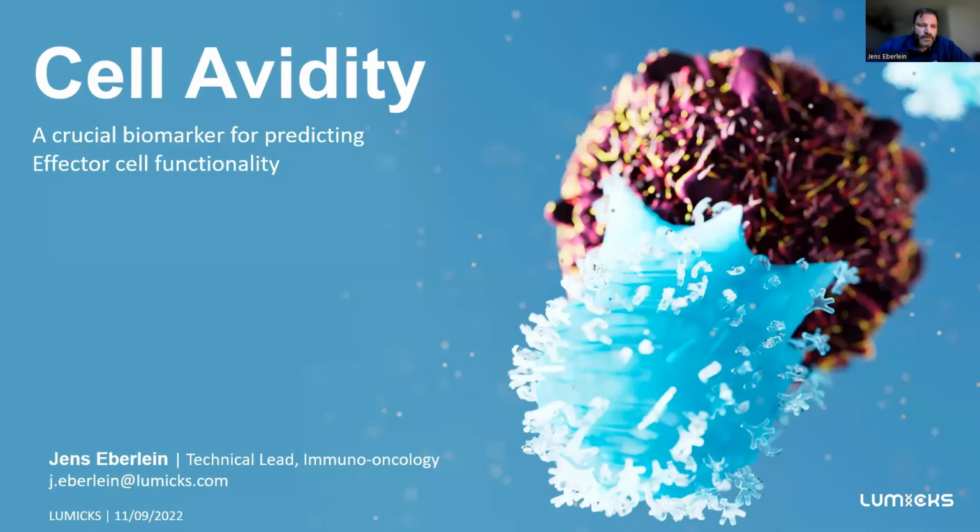By quantifying that engagement or strength of binding, also called cell avidity, we'll explore what it can tell us about the future function of these cells. We'll discuss our current understanding of how affinity and avidity relate to function and how we can use acoustic force to quantify this interaction.